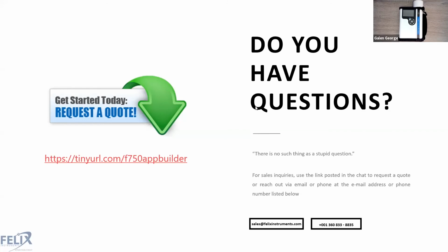So the next question from Brenda is, will there still be support for the legacy instruments in the data viewer and Model Builder software? Yes, we'll always be supporting what we can. There will be no new data viewer or Model Builder software released, but there will be support if you don't want to upgrade, or if you aren't able to upgrade because of some issue with funding or something like that, then we will still obviously support.